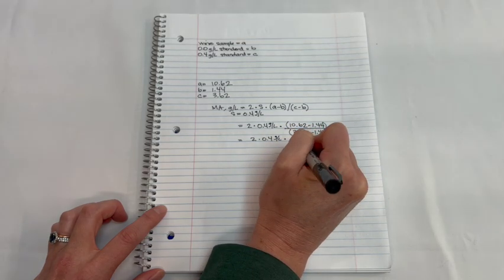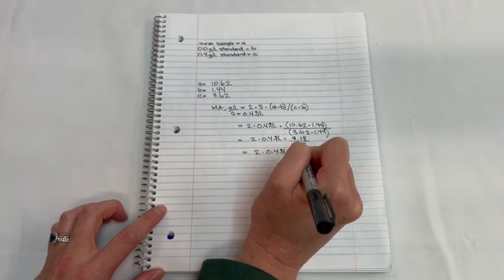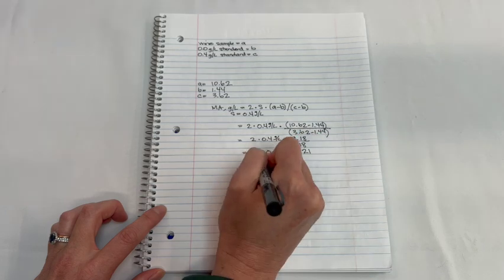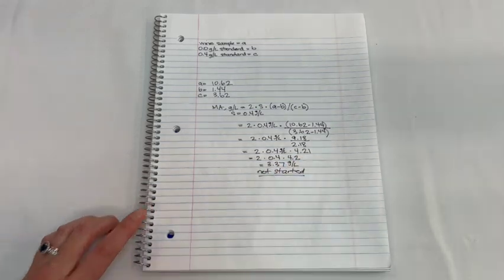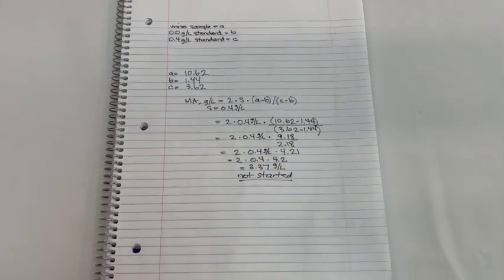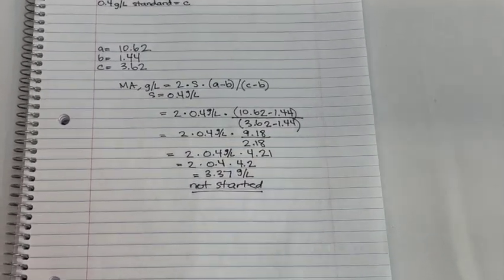After calculating out our value, we can then reference the table provided in the manual to determine the status of MLF completion in our wine sample. Our sample has 3.37 grams per liter malic acid, so our sample has not started MLF.